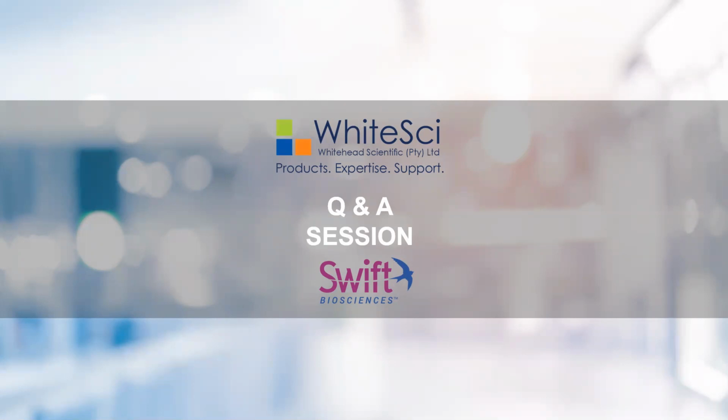That's informative. Just a follow-up question on the quantification bit. If I don't have the TapeStation, can I just do Qubit? Yes, to a certain extent, you absolutely can do Qubit if there's no TapeStation, but Qubit would not automatically give you the molarity. You have to calculate it. Okay.